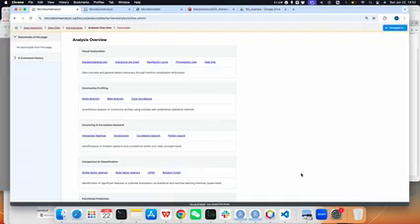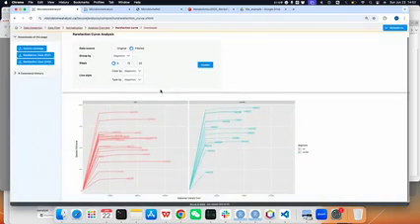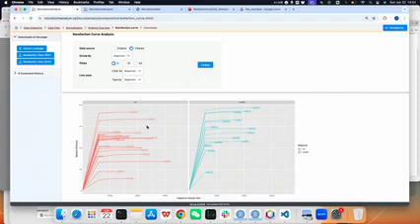So we proceed, and because we didn't do the rarefaction curve before, we can check if our data need a rarefaction. You can see here, most of the samples reach the plateau stage, which means it's more or less okay, except for this one.